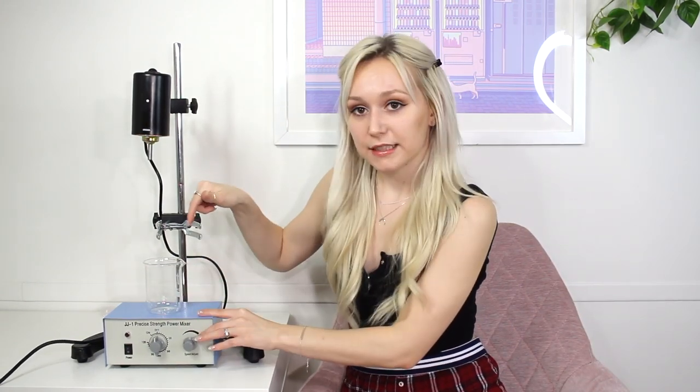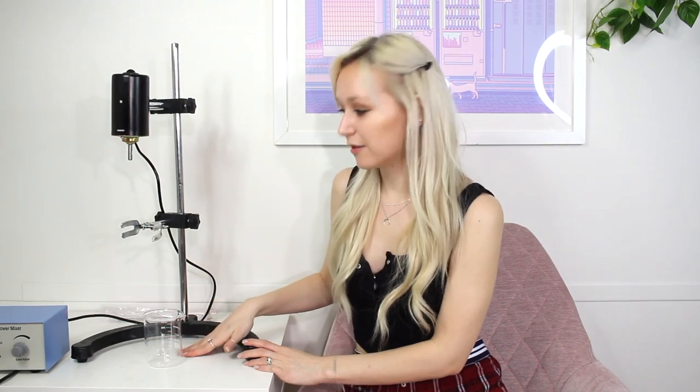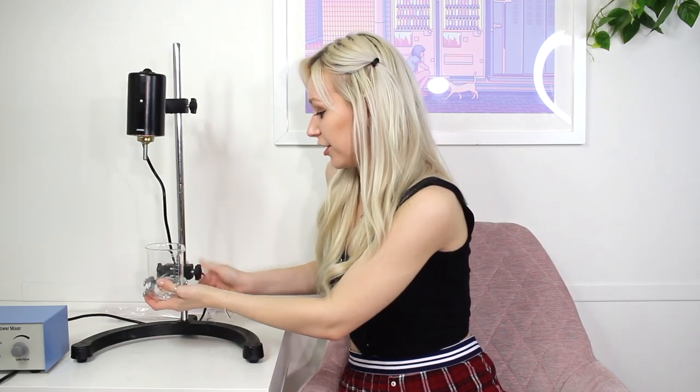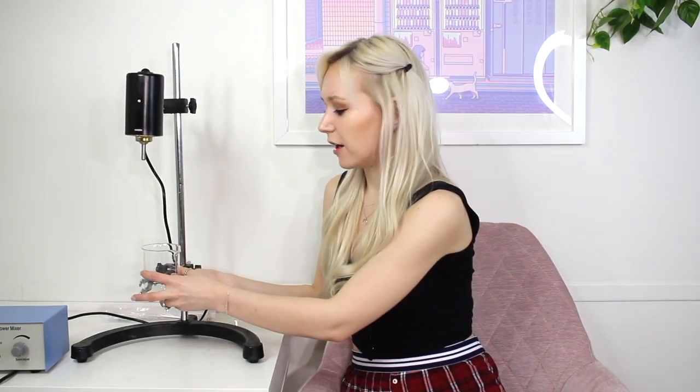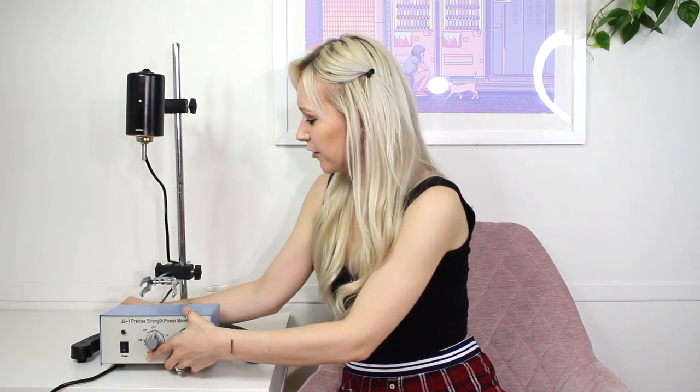You can either balance the beaker on top of this power box while you're mixing, but I don't really recommend that because if you turn this up to a really high mixing power, the box starts to shake, which might not be the safest way to do it. If you're just mixing at a slow power, it's fine. You can also put the beaker in the claw and tighten it for some more insurance. The issue is this only holds a 250 milliliter beaker, so that's kind of a con.